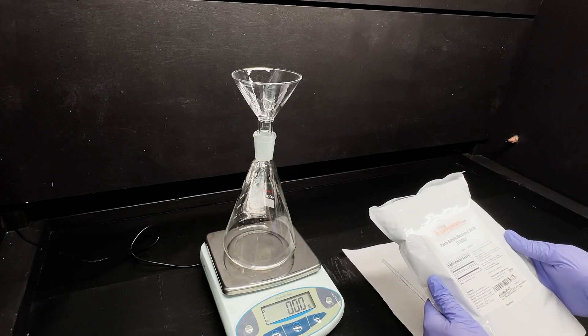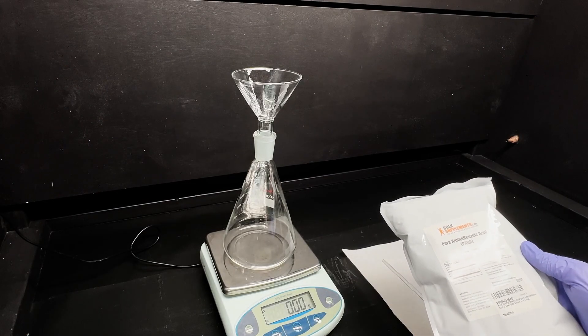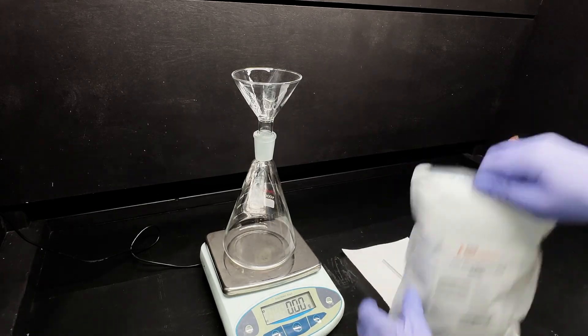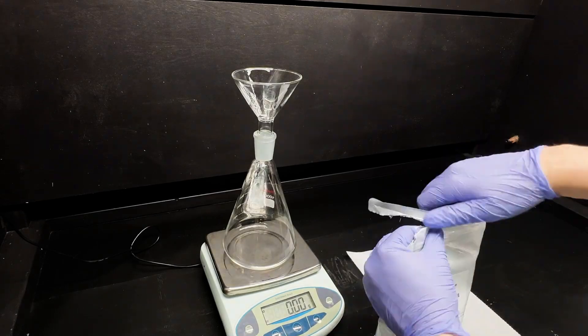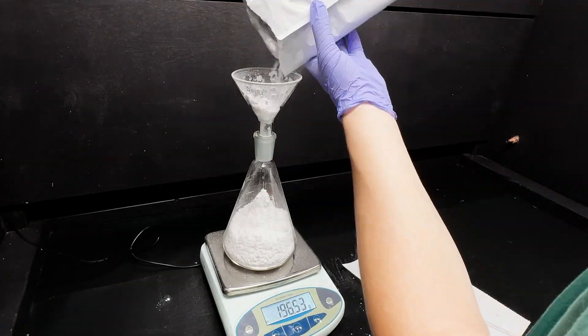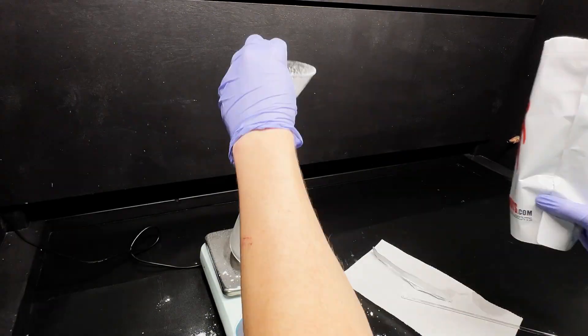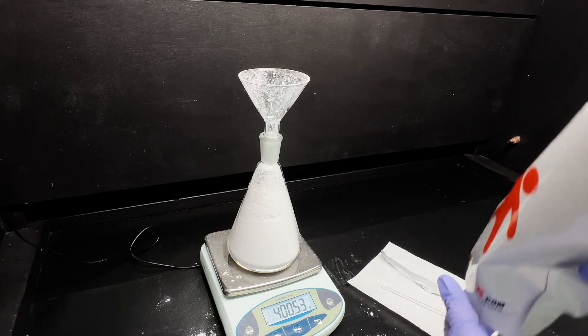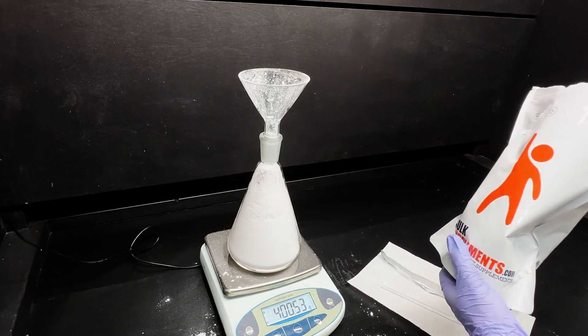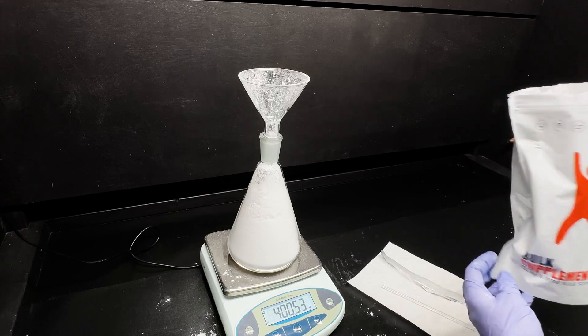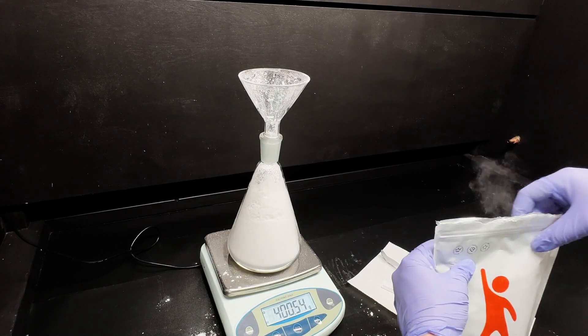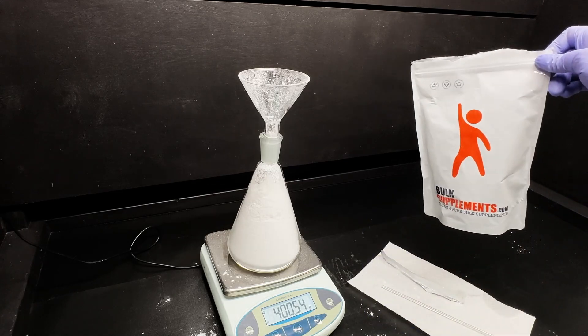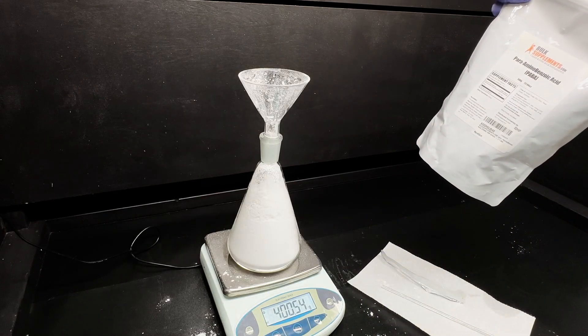All right, here I have vitamin B10, para-aminobenzoic acid, PABA, and we'll charge to the flask, and then we'll start the decarboxylation. All right, let's call it. We got 400 grams in there. Maybe there's a decent amount in the bag, but that can be for future runs. All right, and we'll set this up for distillation, where it'll destructively decarboxylate the para-aminobenzoic acid and collect our aniline.